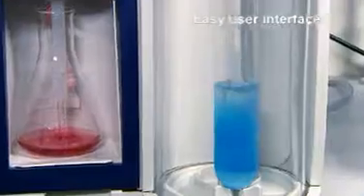Select the program and start the distillation. Even this basic version automatically dispenses reagents such as dilution water and alkali using accurate and reliable bellows pumps.